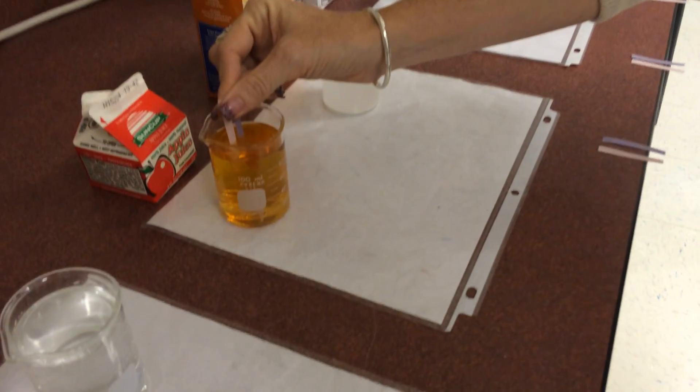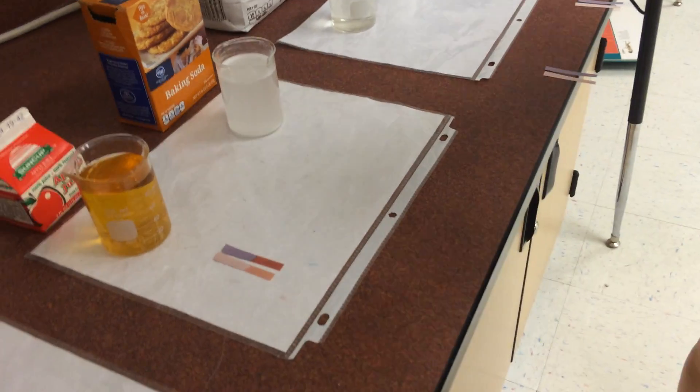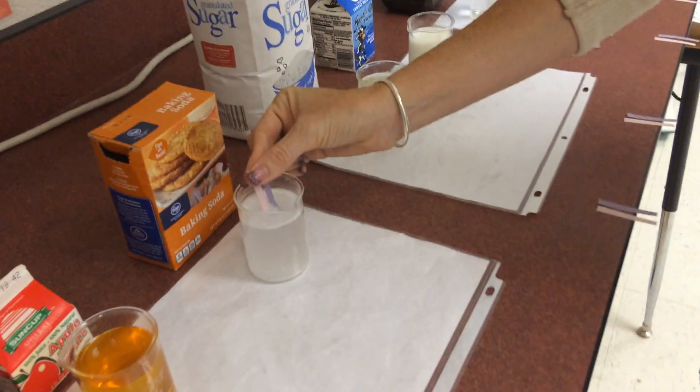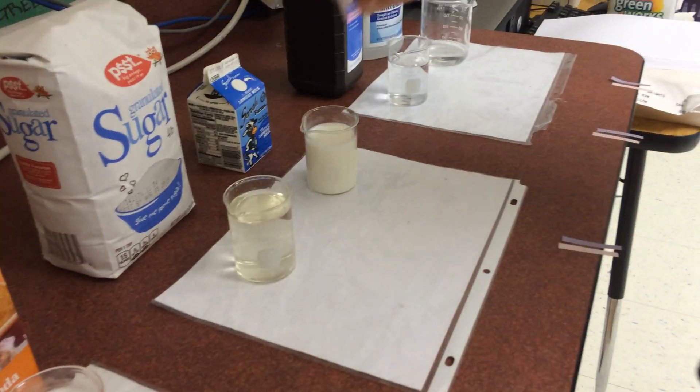Alright, apple juice: red plus red equals acid. And baking soda: blue plus blue is a base.